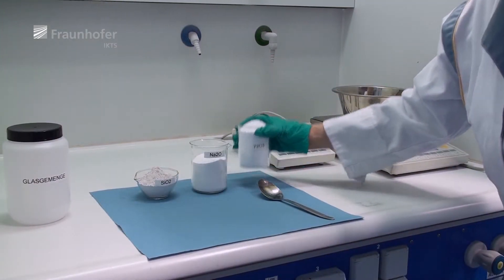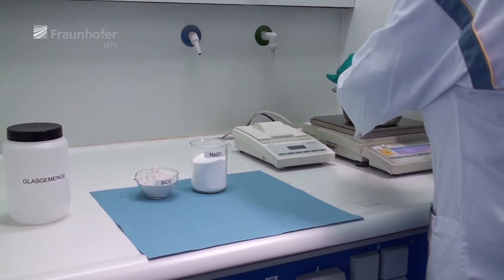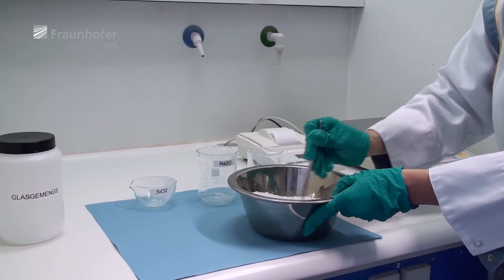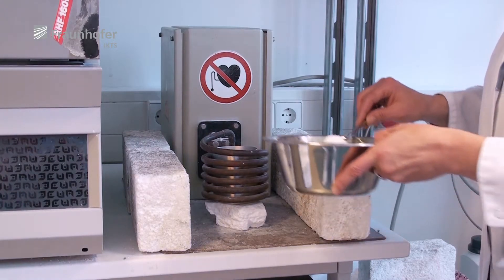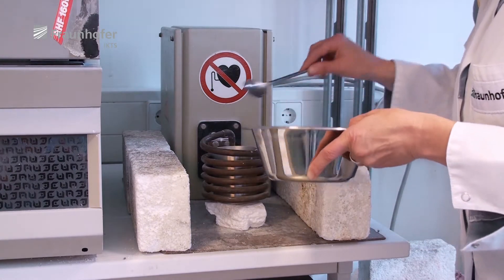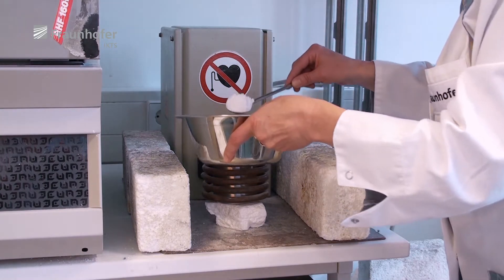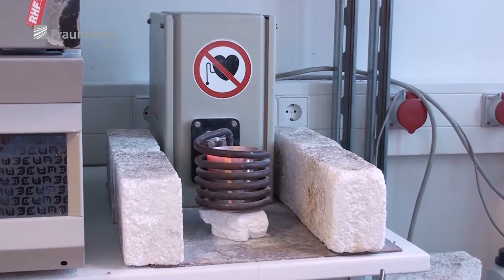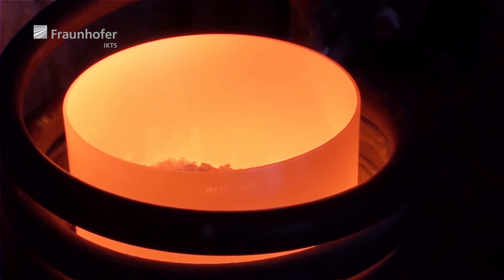The glass melting process begins with the mixing of all necessary raw materials. The oxides, carbonates, or hydroxides are weighed in the right proportions and then immediately mixed. In the second step, the mixture of raw materials is pre-melted in a platinum crucible and heated by an inductive coil. This is necessary to compact all raw materials in order to get a sufficient amount of melt in the platinum crucible.